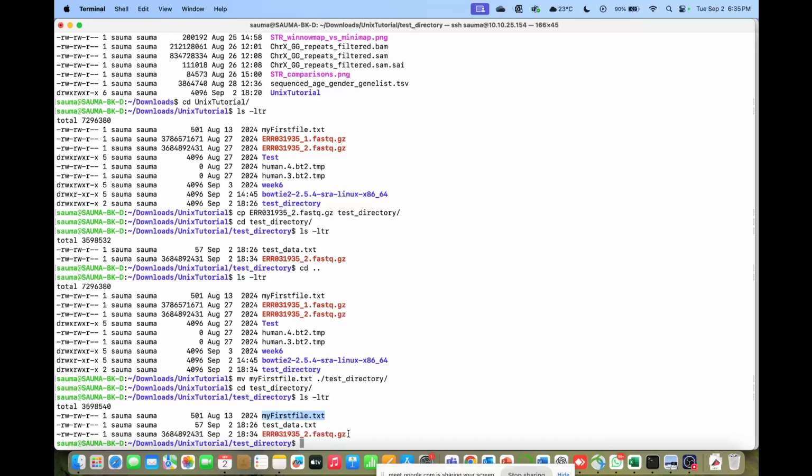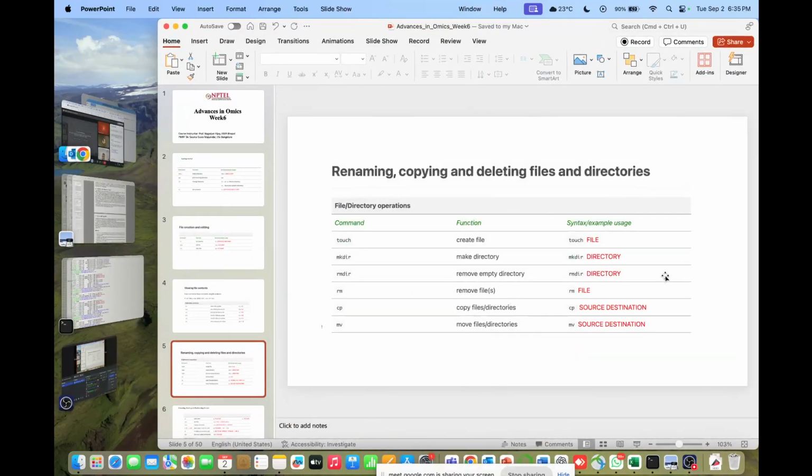Okay. So yeah, these are pretty straightforward, but these commands you need to know to navigate through the whole system, because here you won't have windows where you can click on a particular folder and it opens the folder. It does not work like that. You have to use the command line to navigate yourself. So knowing these commands is important, right?